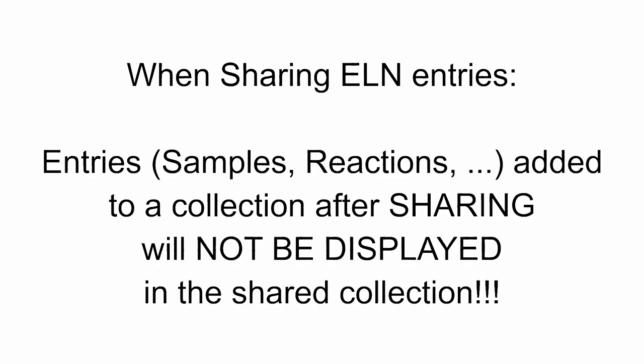Hence, if additional items are added to a collection after sharing, this new content will not be displayed in the shared collection.